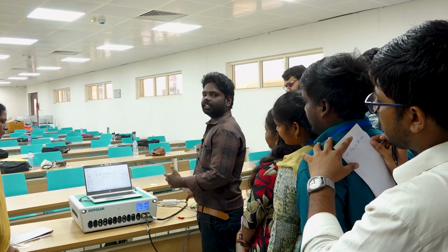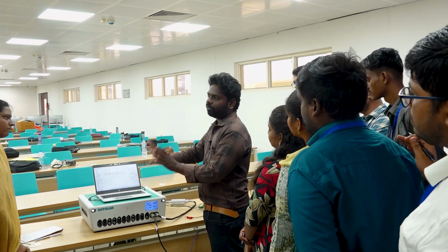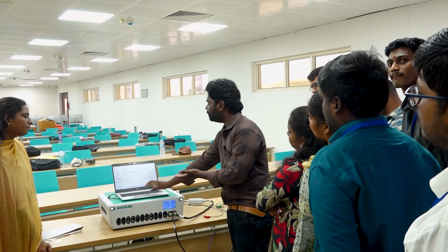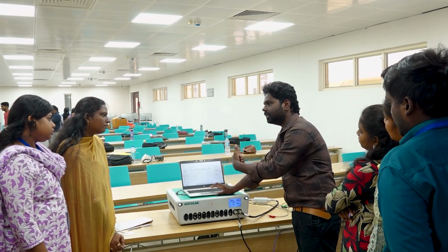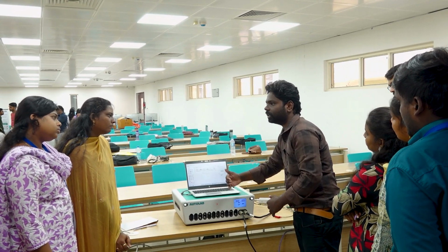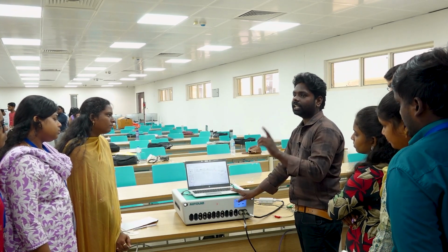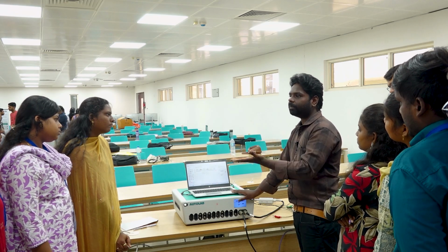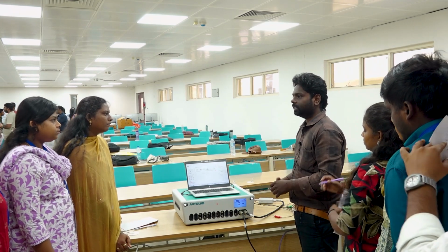So just leave the connections, because connections vary from instrument to instrument. First we will just take a look at the graph, then we will analyze what parameters we are able to get. One more thing, as I said earlier, this is just data we have to interpret, and only then can we get the exact results.